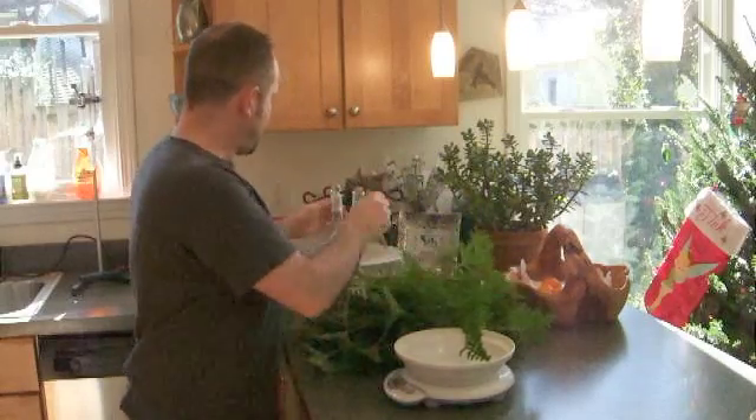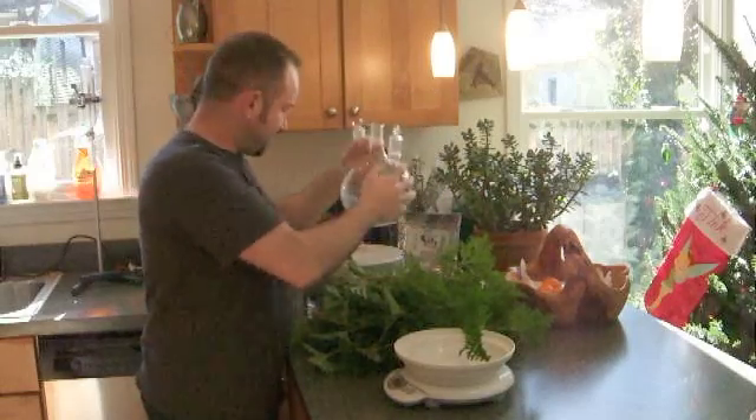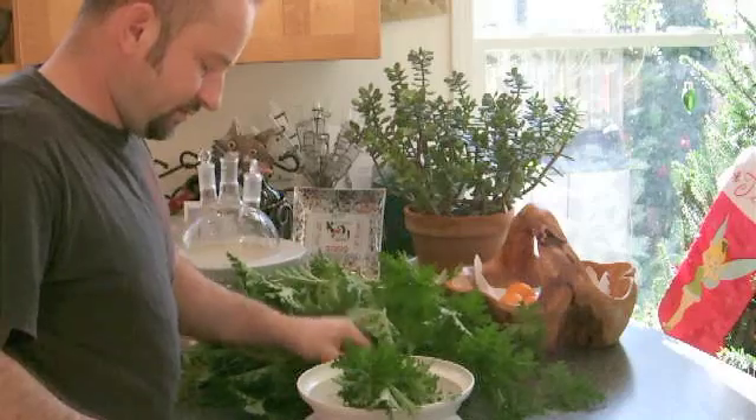The first thing we need to do is chop it up and we're going to put it into this two-liter round-bottom flask. I like to weigh everything just to see what kind of yield you get here.